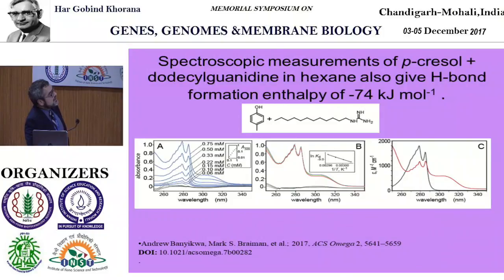You can also see this equilibrium shift by adding heat. As you change the temperature, the lowest temperature is the highest spectrum here. As you raise the temperature, you tend to reduce the size of this peak. This is fully reversible. You can not really see it too well, but each one of these lines of a different color is actually the superposition of two spectra measured first going up in temperature and then back down. And by fitting these using principal components analysis, we can figure out that the spectrum of the other component besides the black one is what's shown in red here.